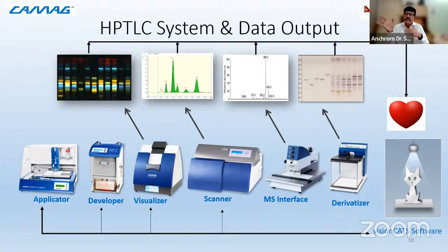So whatever you're sending into the mass spectrometer has to be in its purest form, and that is why this TLC MS interface helps you out with that. And after that, you come to the last component, that is derivatization. Now, this is an interesting concept.